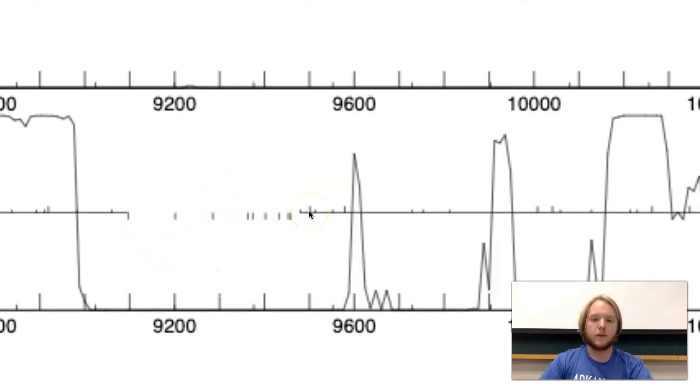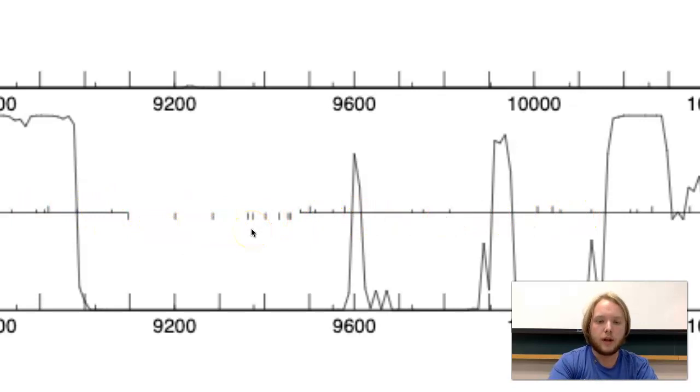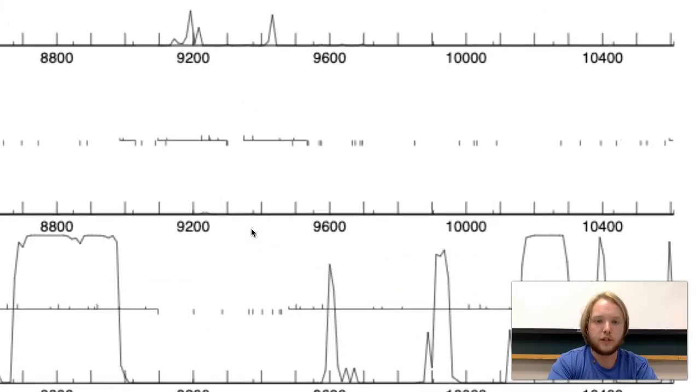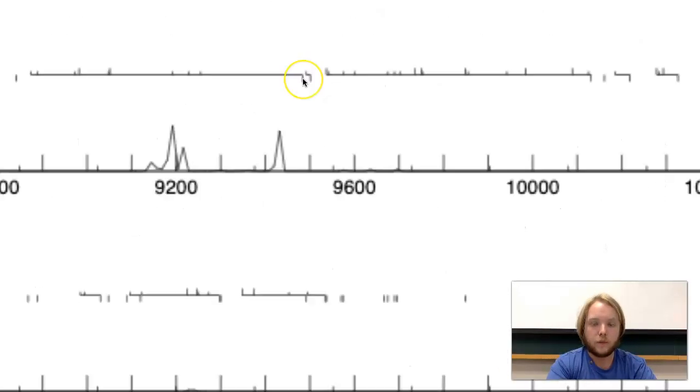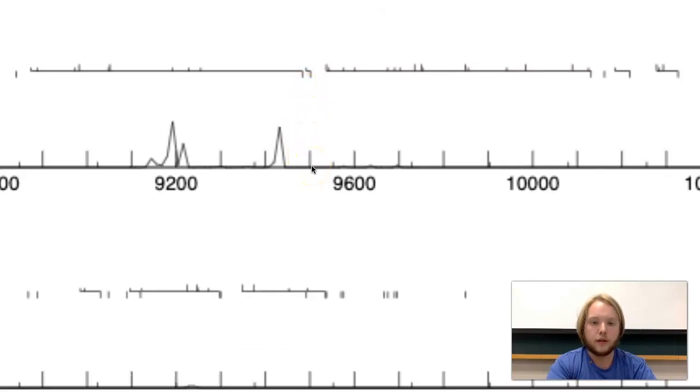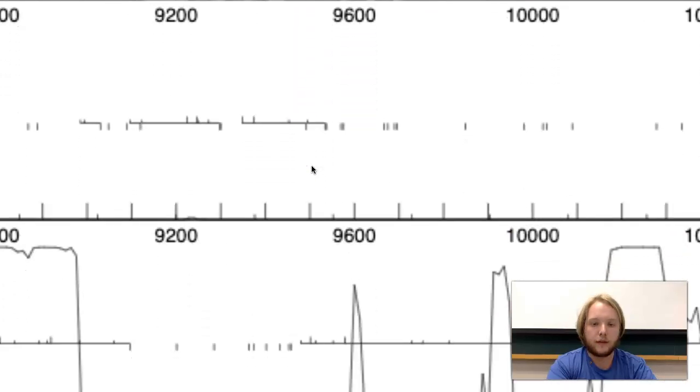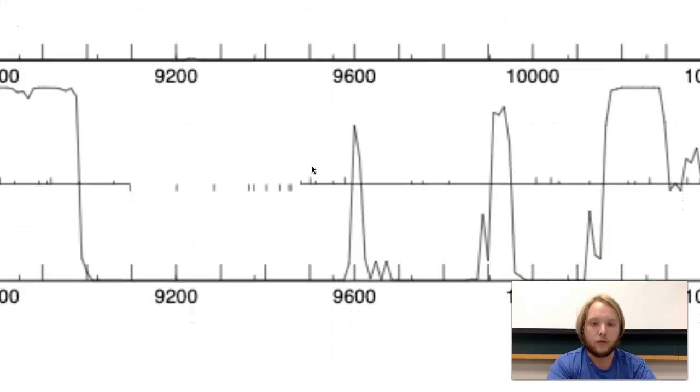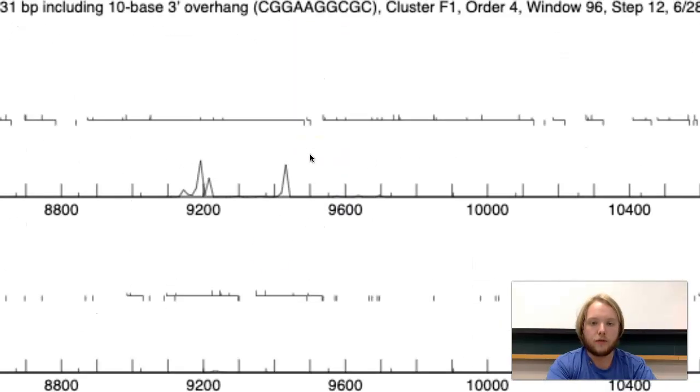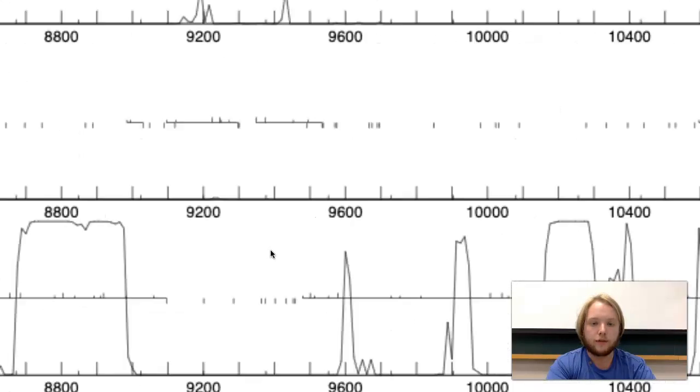I've explained the upticks, downticks, and spikes. What's this long bar here? Those actually represent complete genes. The previous gene was up here and ended right before 9,500. Our tape measure protein begins at 9,504. That's an example of two sequential genes that are in different frames.